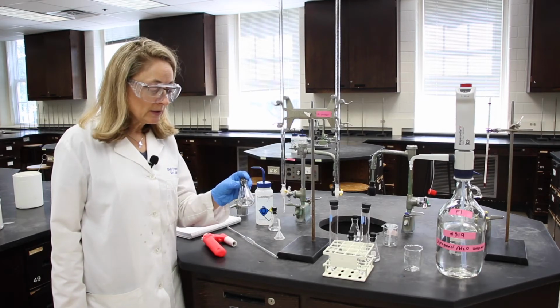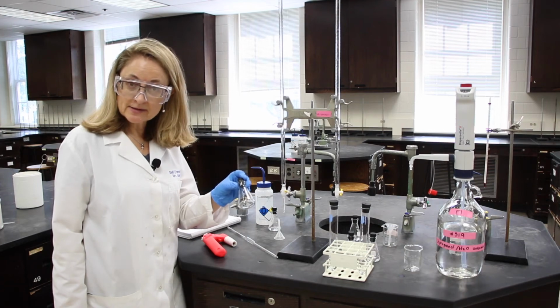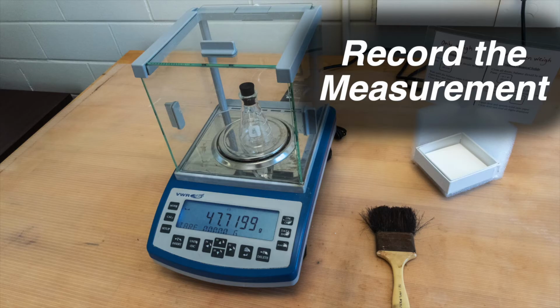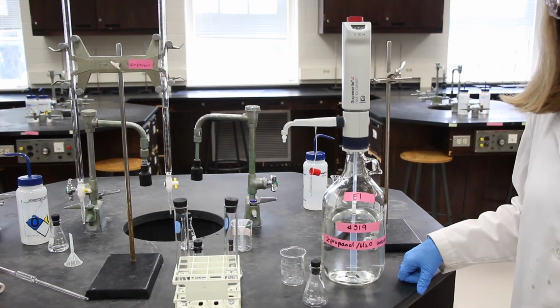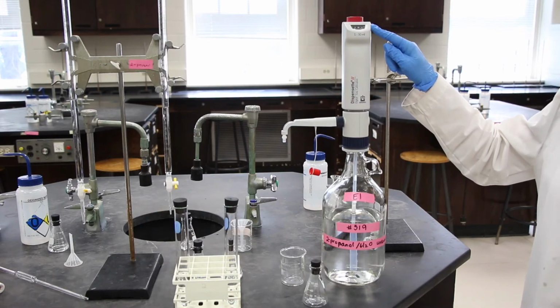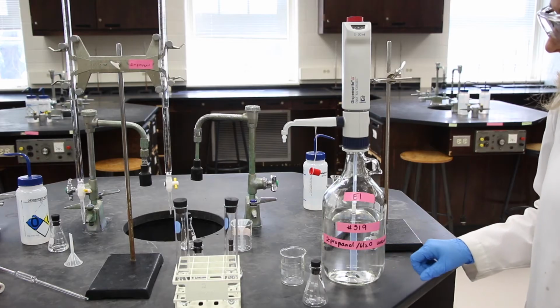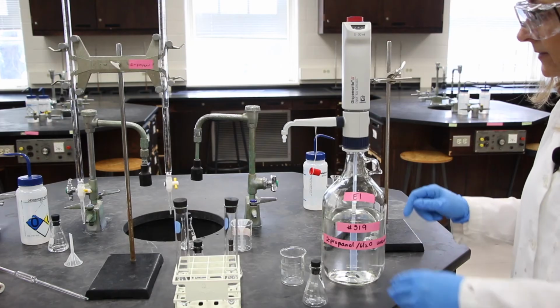The first thing we need to do is weigh a clean and dry Erlenmeyer flask. In step 2, we'll dispense 10.0 milliliters of our unknown 2-propanol water solution to our Erlenmeyer flask.